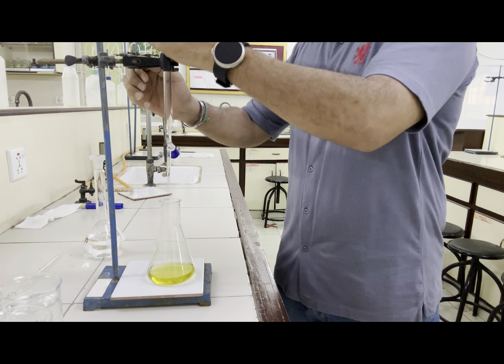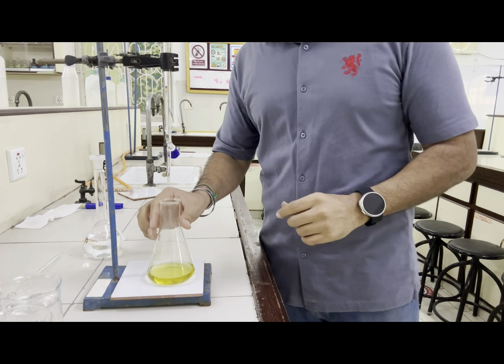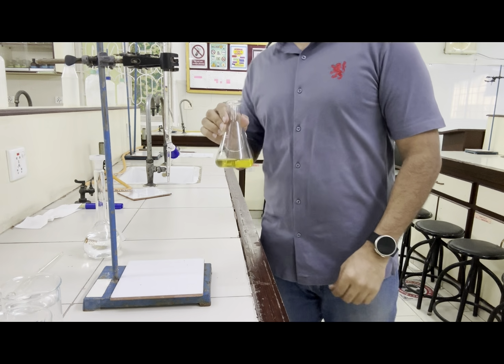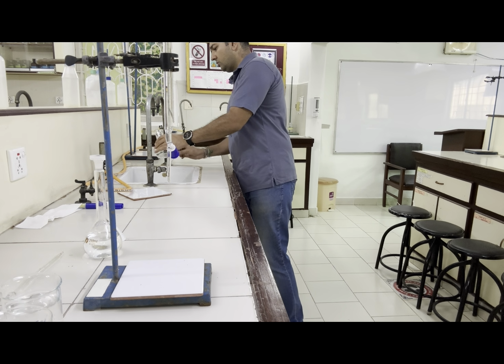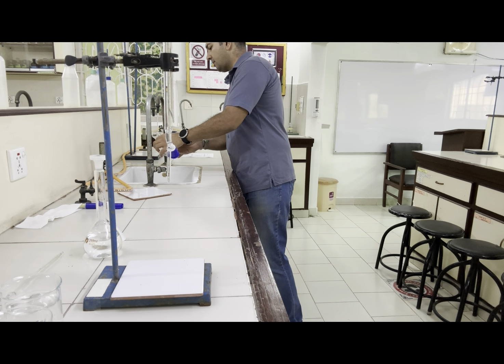The second thing to do here is empty and rinse this conical flask, which is used once. So we can rinse it with the tap water.